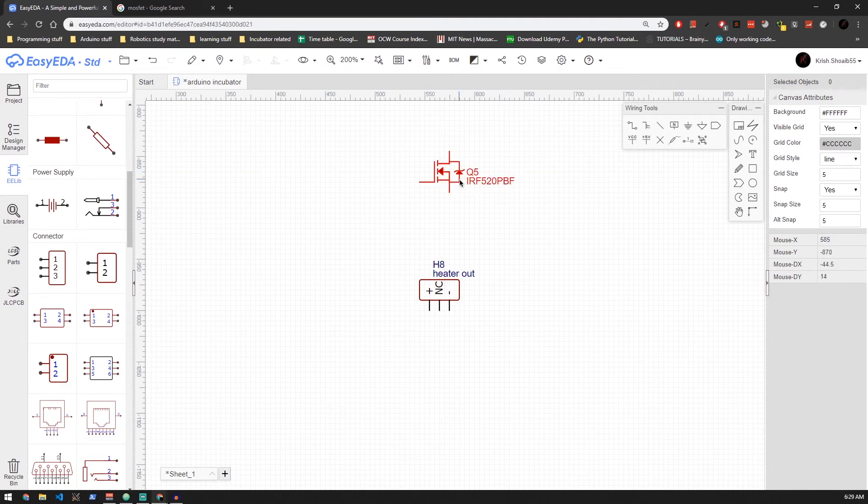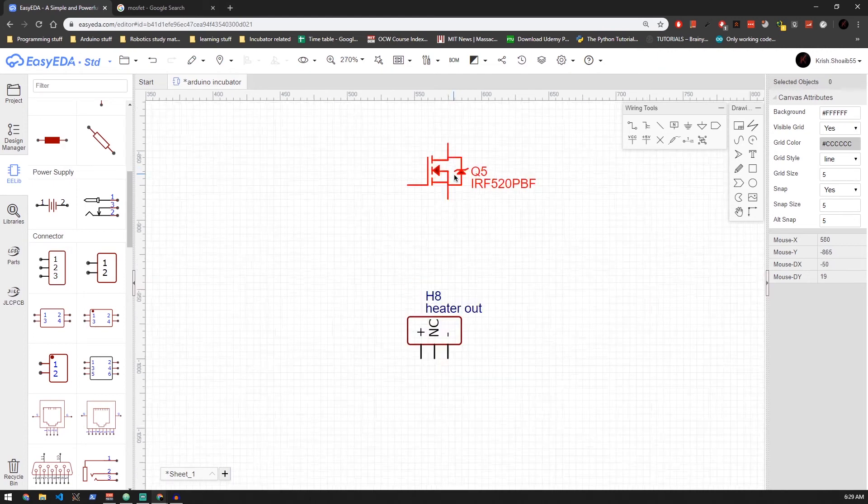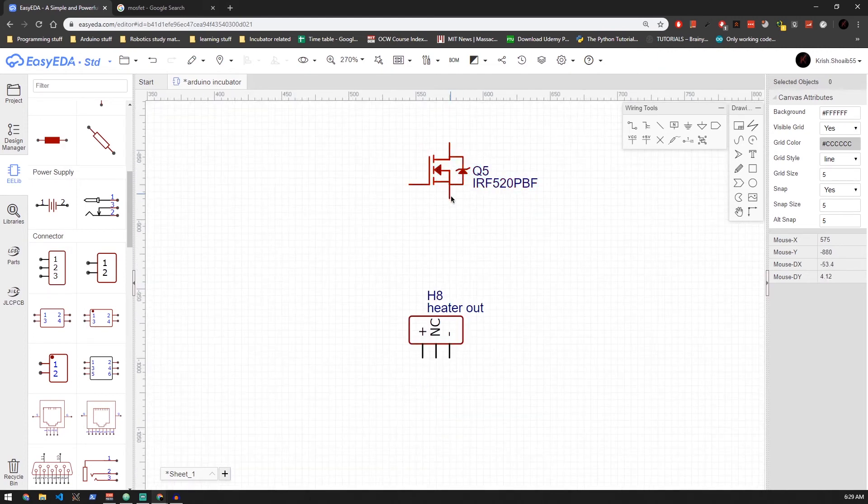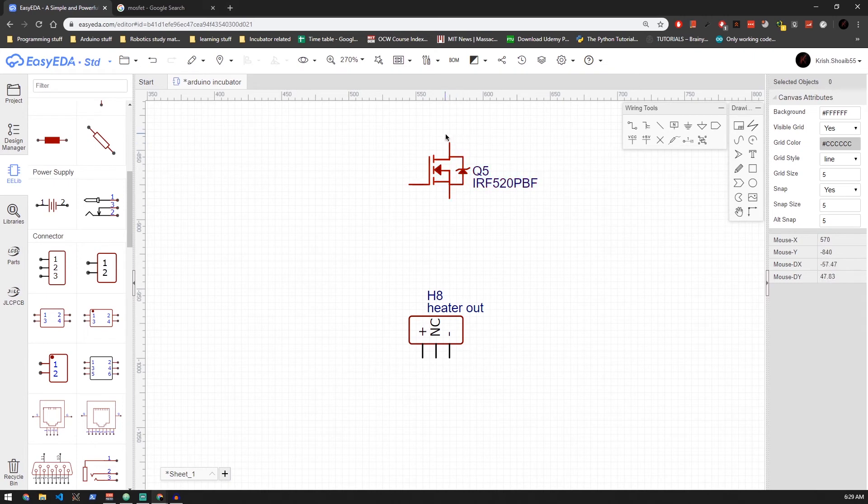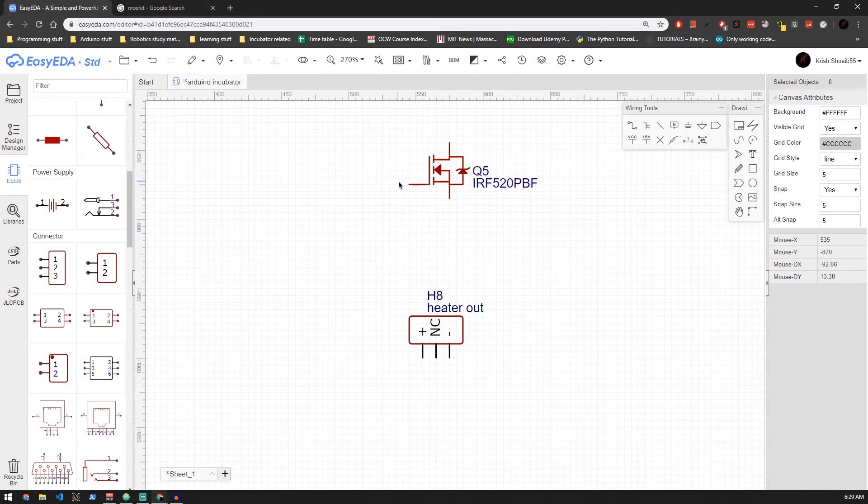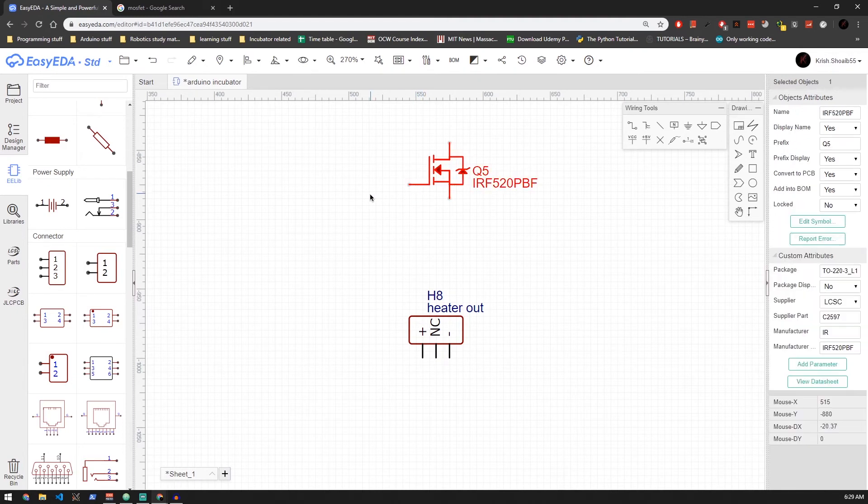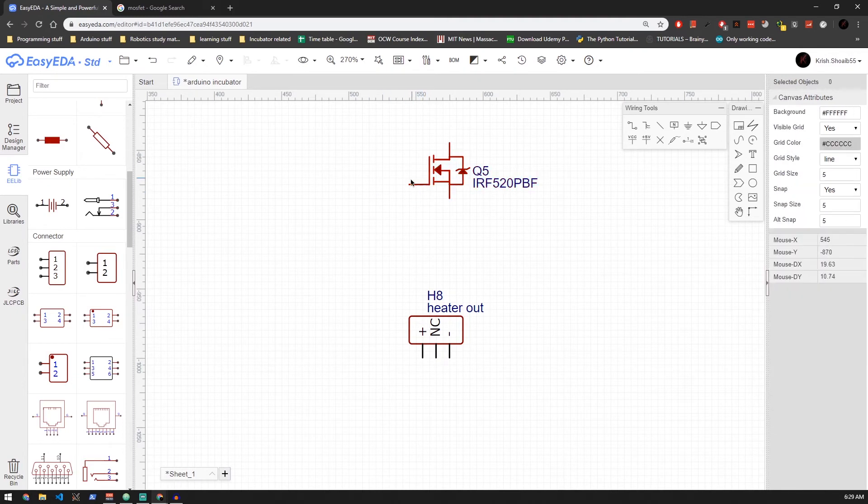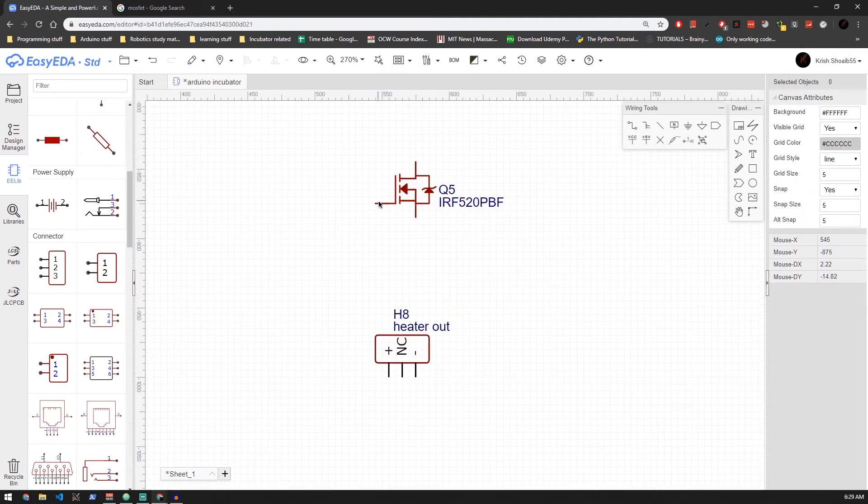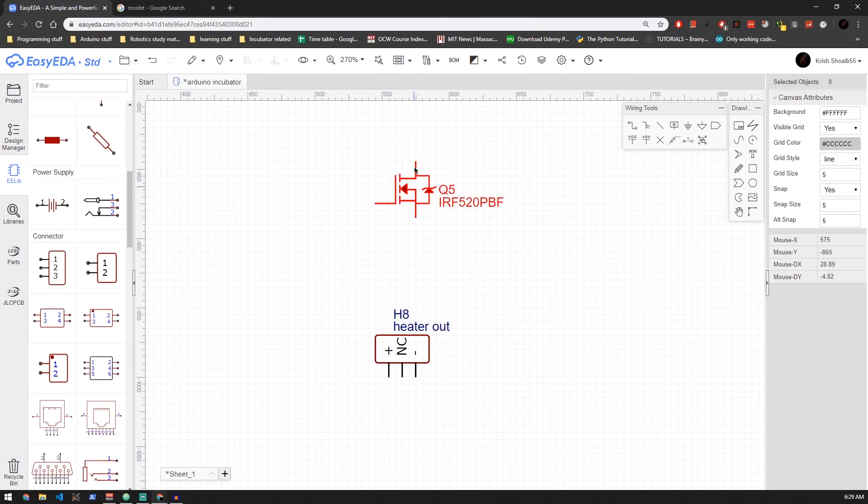The bottom one in the schematic is called source, which is normally connected to ground. That's common with Arduino and 12 volt. The one to the left is called the gate, which is going to turn on or off the motor. The one on the top is called drain, which is normally connected to negative or ground of the heater. And of course, we need to connect 12 volt directly to the heater. So let me just go ahead and wire it up and I'll explain how it works when I'm done.